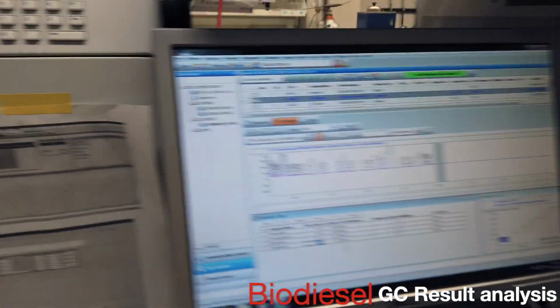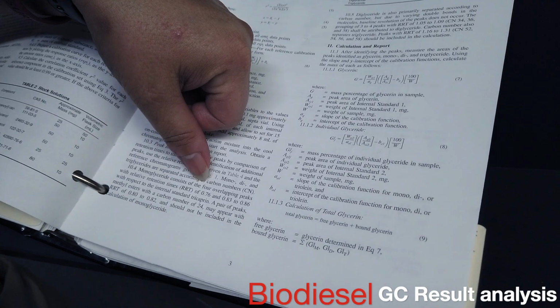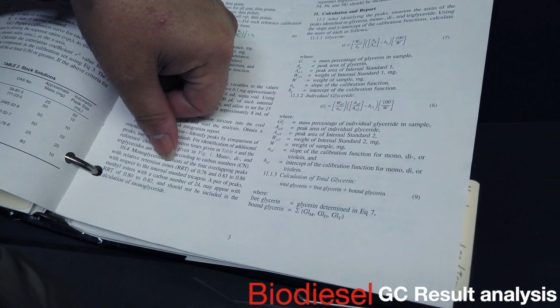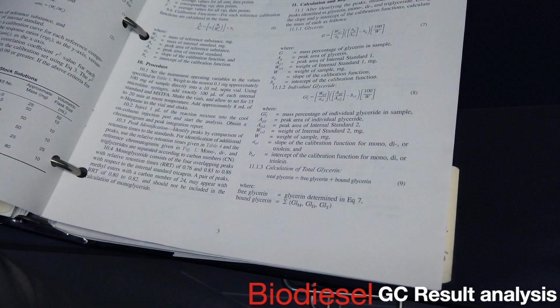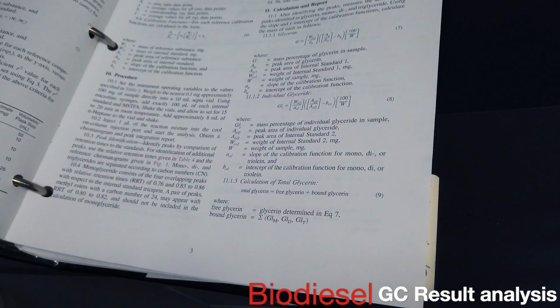So here it says, if you look here, monoglyceride, so peak identification, right? Monoglyceride consists of 4 overlapping peaks with relative retention times of 0.76 and 0.83 to 0.86 with respect to the internal standard tricapran. So if you know where tricapran is, then if you go to 0.76, 0.83 to 0.86 of that, that's where the mono-olein is going to sit.